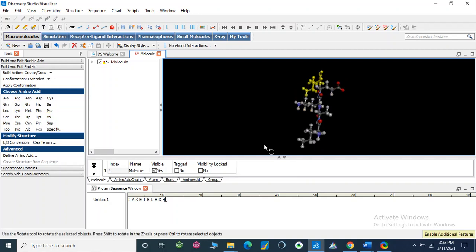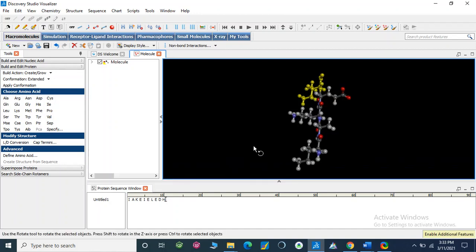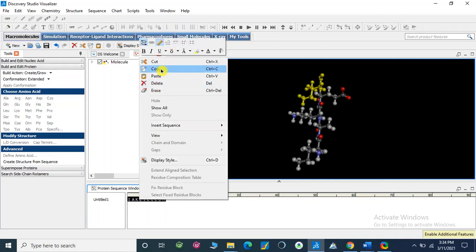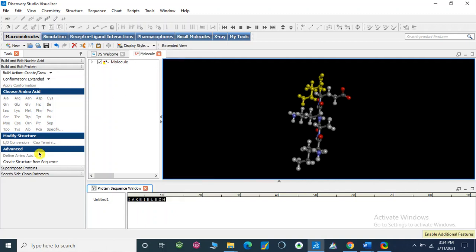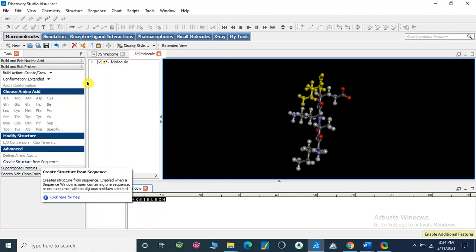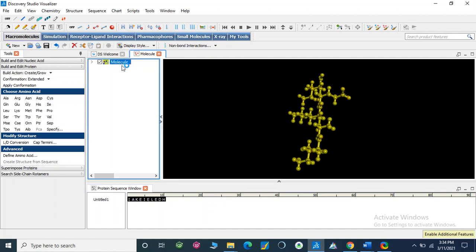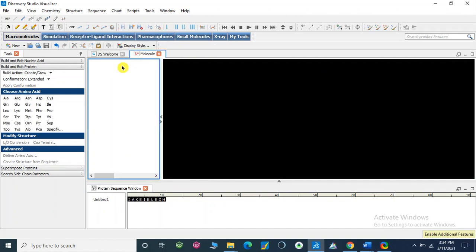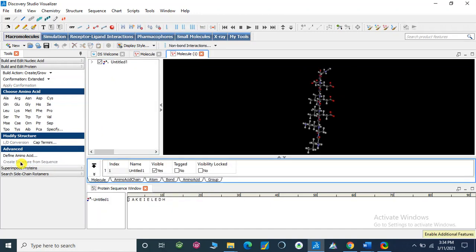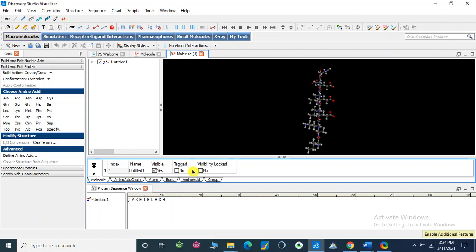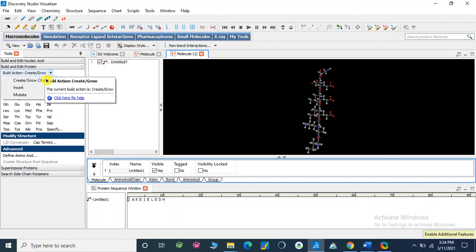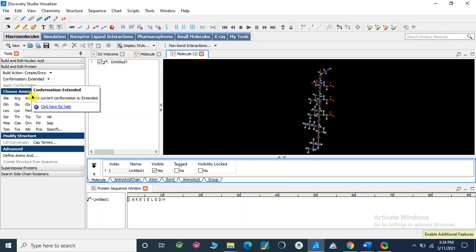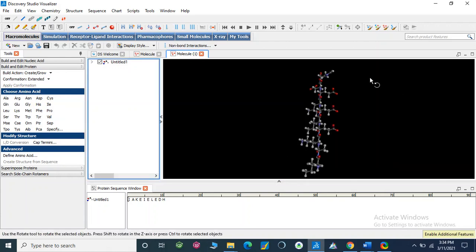We can also select this sequence as a whole. Here we can create structure from sequence. First I will remove it. Now we have copied this sequence and create structure from sequence. We can create a structure from this sequence. We can also build or create protein by this section, create grow chain. So in this way we can make a sequence of protein.